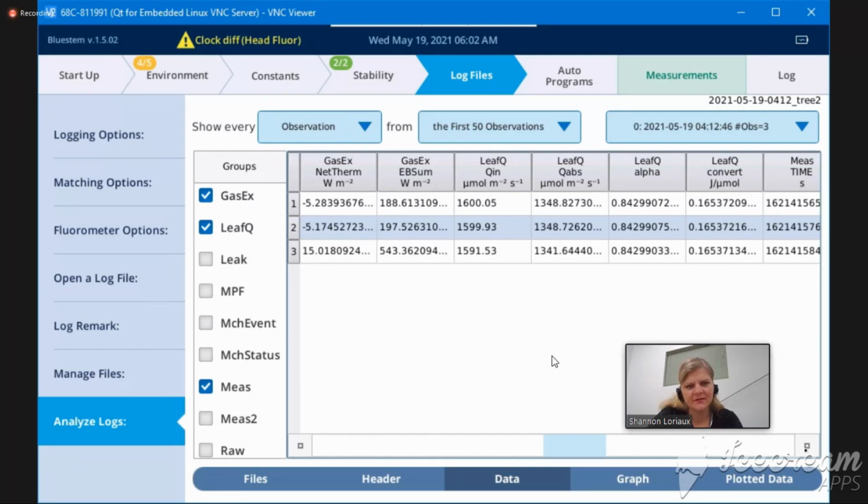Okay, but at this high light level, I would expect much higher conductance and higher photosynthesis. So I think really that RH value that Elizabeth talked about earlier is probably the key as far as why your photosynthesis rates are so low. I mean, at this light level, I assume this is a C3 tree. Is that right? Is this a C3 or C4? Most C.